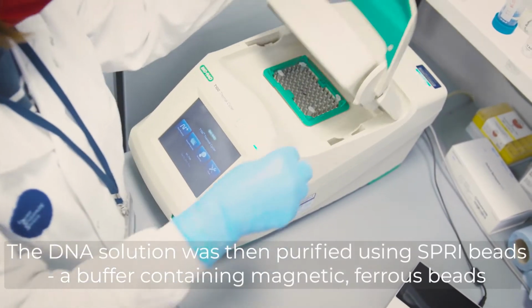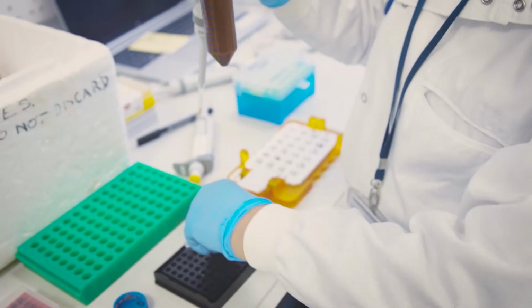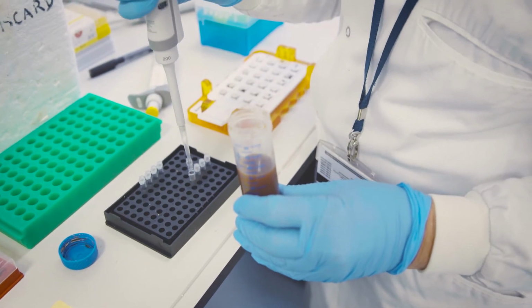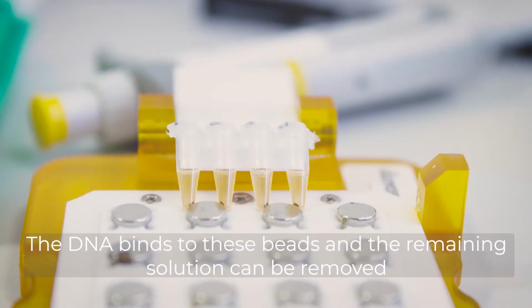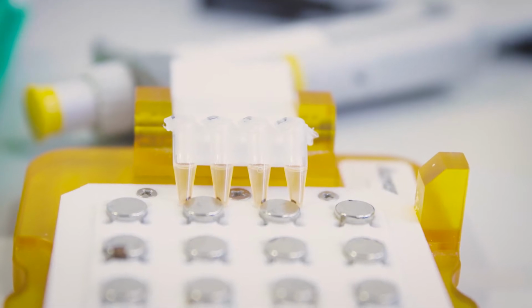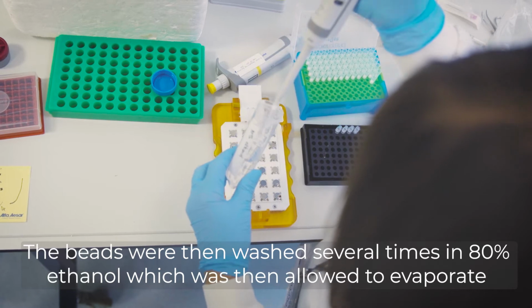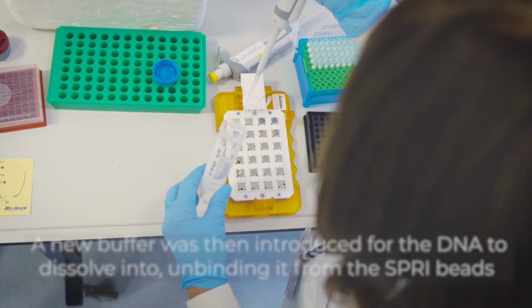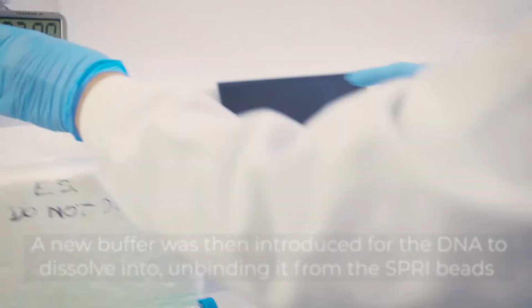The DNA solution was then purified using SPRI beads, a buffer containing magnetic ferrous beads. The DNA binds to these beads and the remaining solution can be removed. The beads were then washed several times in 80% ethanol, which was then allowed to evaporate. A new buffer was then introduced for the DNA to dissolve into, unbinding it from the SPRI beads.